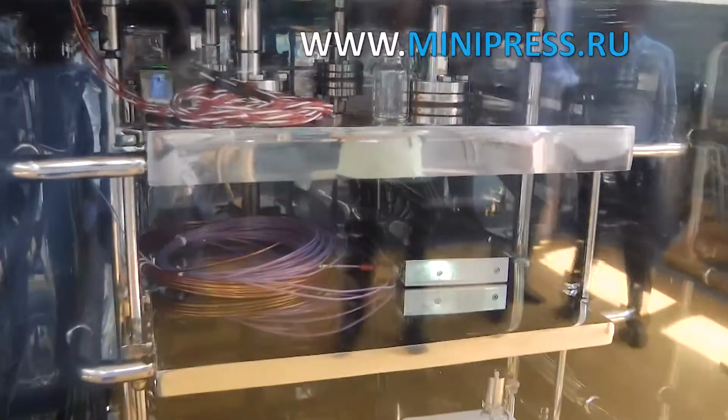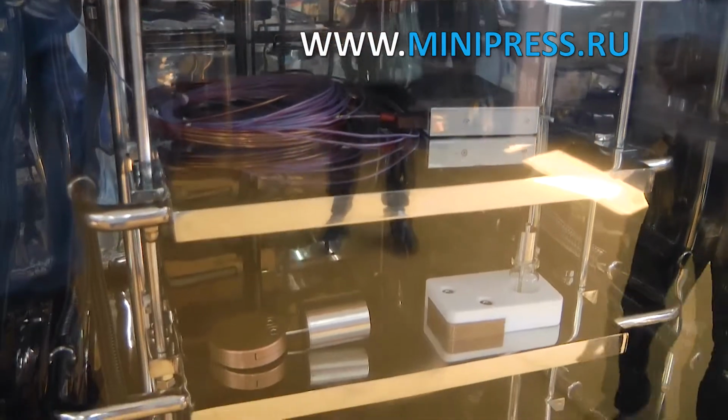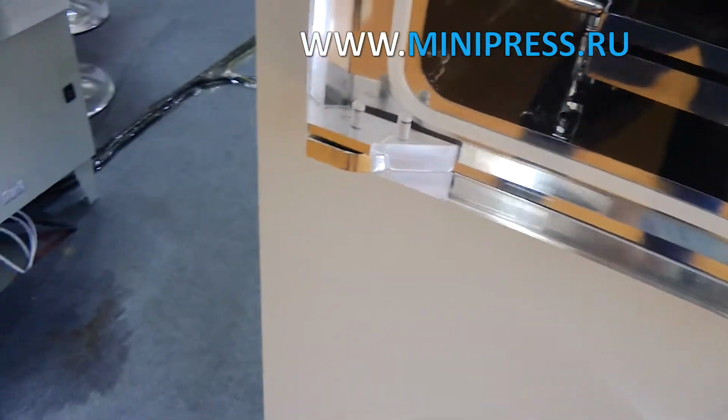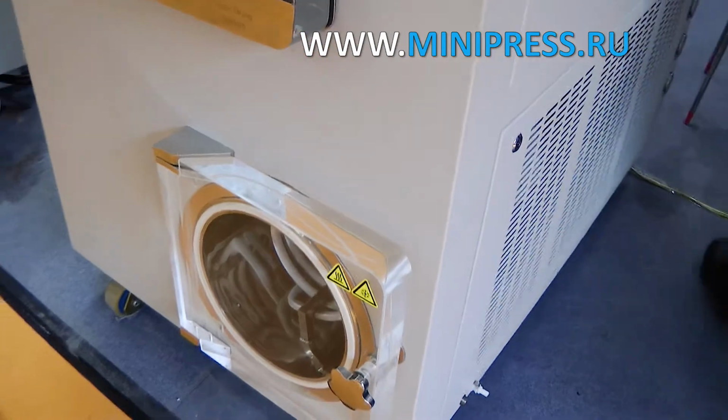Laboratory equipment carries out the process of preparing samples for research. The lab engineer clarified that last month, they had a breakdown of the apparatus for drying vials of solution. A dryer had to be purchased as soon as possible, since quality analysis of raw materials in accordance with production technology is carried out each new batch of material supply.